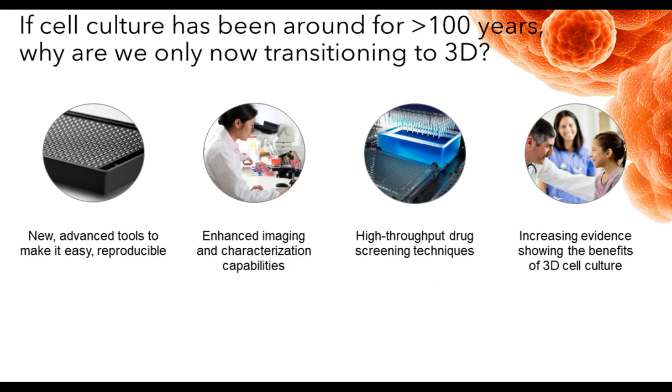You can do better imaging. Shown here is looking at it down a microscope, but of course there are automated high-throughput imaging technologies widely available now. That relates to the other side of it, shown on the third panel there, which is that standard high-throughput instrumentation and robotics have been applied to the study of 3D cell culture. That's also accelerating it as a means by which it can be used in compound screening and drug discovery. And there are increasing benefits, of course, in developing the cells in 3D for use in research as well as therapeutic benefit.